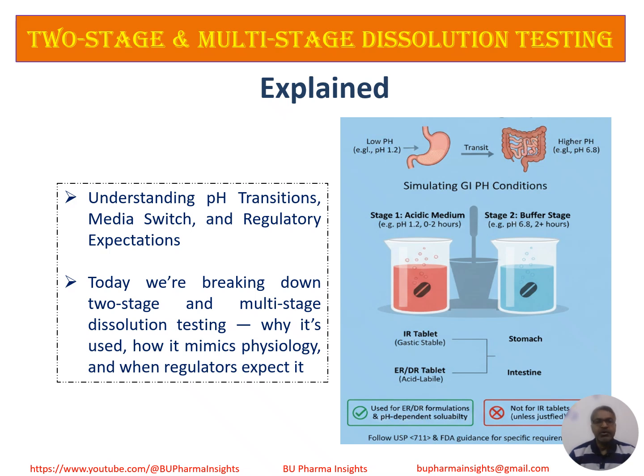In this video, we will discuss two-stage and multi-stage dissolution testing and its applications. This is essential for enteric-coated tablets, delayed release, modified release systems, and products that require GI simulation. Also, for many modern dosage forms, a single-stage dissolution test is not enough. Profile comparison is key to understanding real drug release behavior.